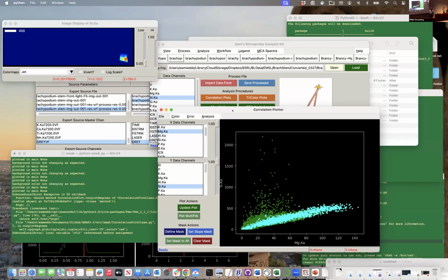There's a question in the chat. Can you export correlation with the highlighted area, so I can replot the highlighted area? If I remember right, every region that's a color will come out as a different column in the export plot. If it doesn't, it will by tomorrow.